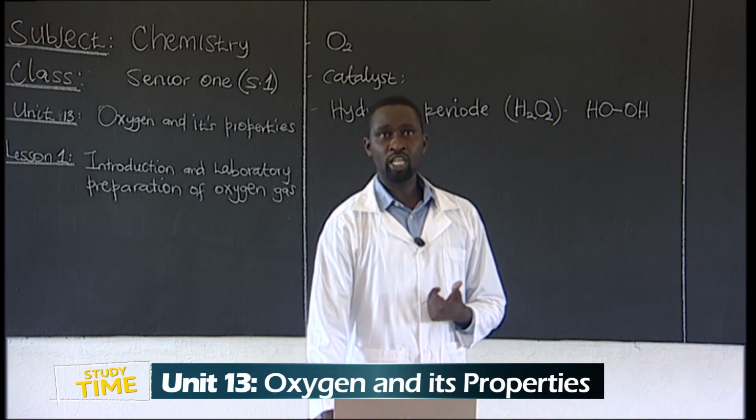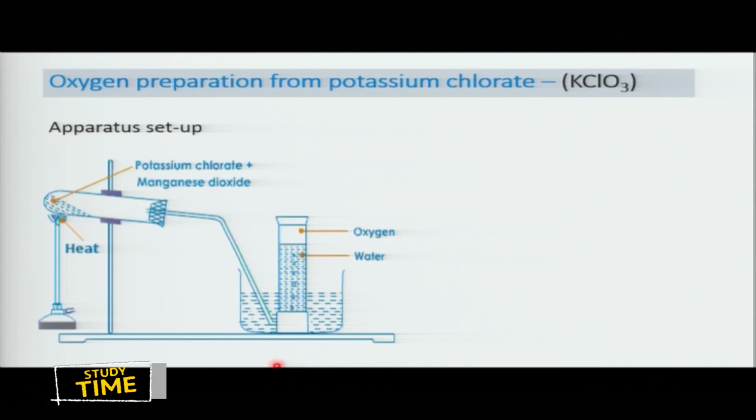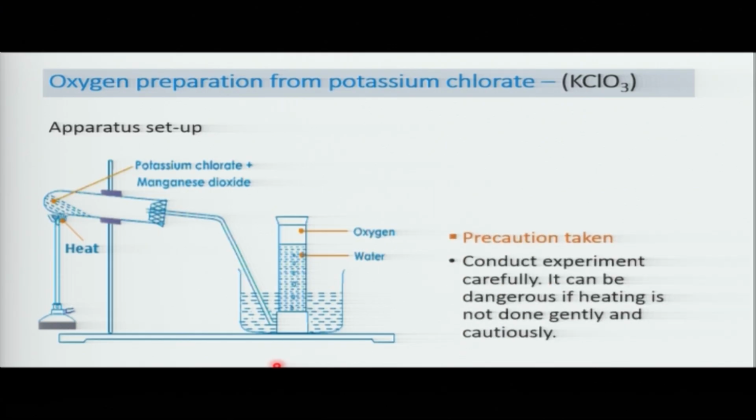So let's quickly look at one more, that is preparation of oxygen from potassium chlorate. That is the setup. Take a close look at it. And as usual, it's always best to take the precaution. Let me first give you the precaution, then I illustrate what is happening.